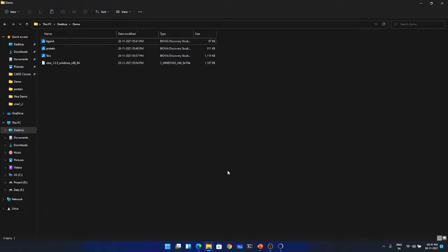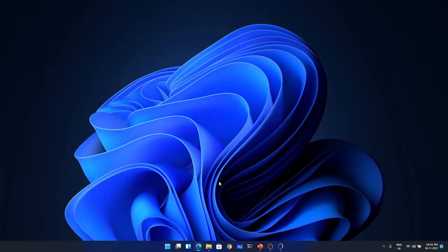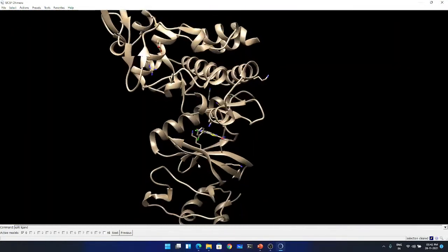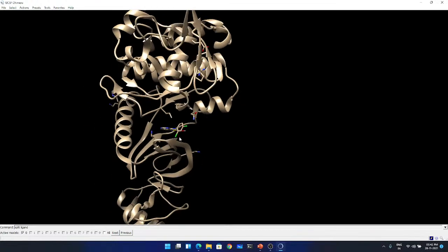The next thing is that we need to convert them into PDBQT to be useful for docking. You can do that using either the scripts which come with the ADFR that you have installed, or you can use AutoDock Tools if you're comfortable. I'm going to show with the ADFR tools how you can convert this into PDBQT files. The next thing we need is the coordinates of the search box that we want to keep. So how do we generate the search box?